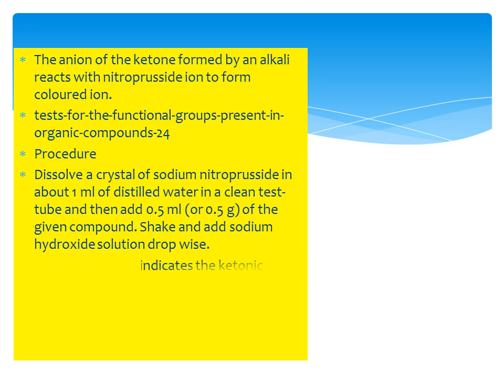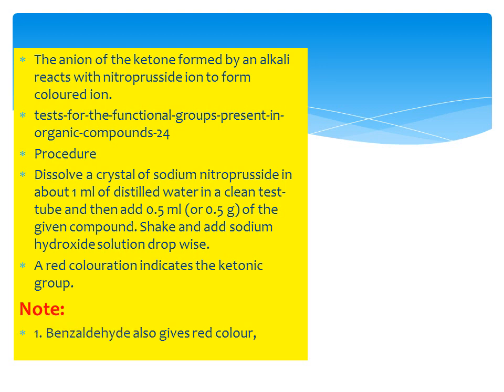Another important test specifically used for ketones is the sodium nitroprusside test. The procedure is that you take crystals of sodium nitroprusside in distilled water, and you add 0.5 ml or 0.5 gram of the given organic compound which is to be tested, and you add sodium hydroxide dropwise.